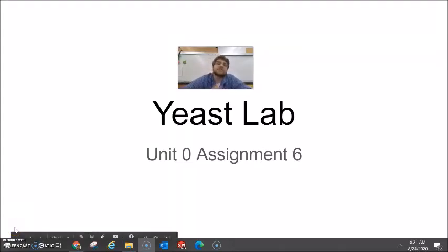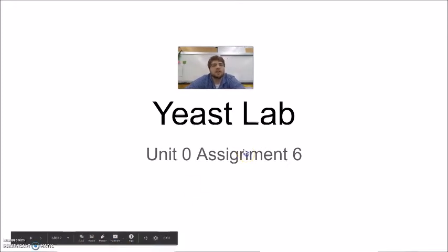Hey class, today we are doing a yeast lab. I'll be walking you through the setup and you will be collecting and analyzing data. And this will be Unit 0, assignment number 6 in Google Classroom.